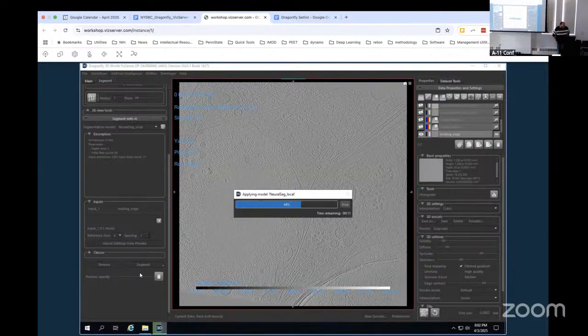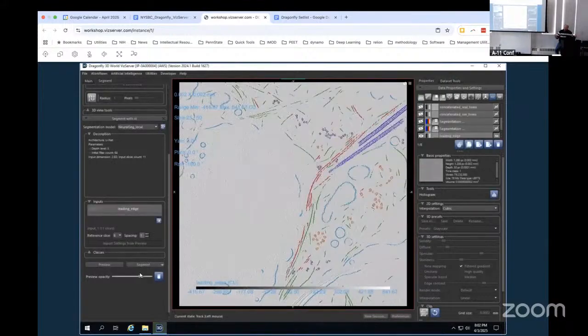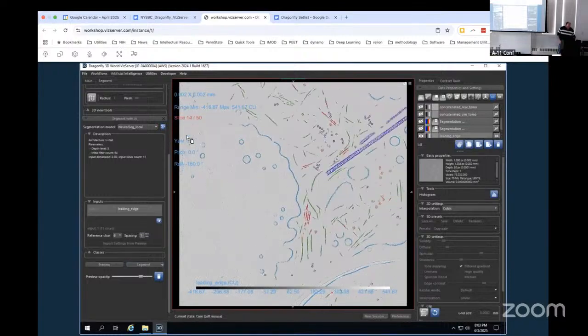But as a first pass at making a generalized CryoET model, it's pretty fun. And we may be the ones that make a better one. It's so easy to run this on more tomograms, see where it doesn't do well, import that data, retrain. So making it better is not hard. Someone will do it.